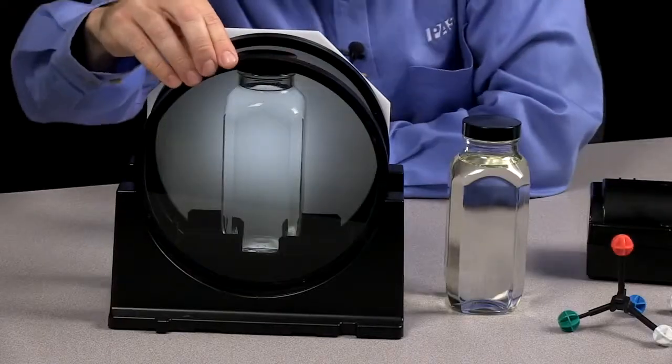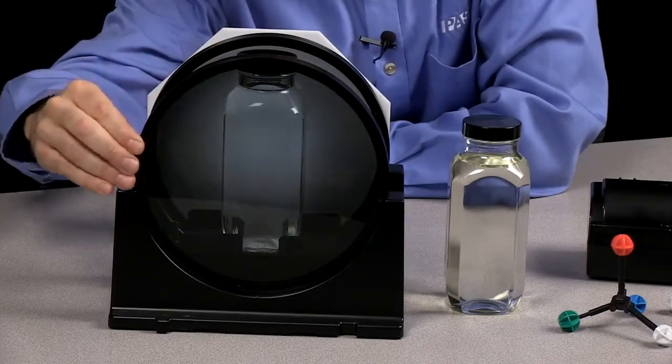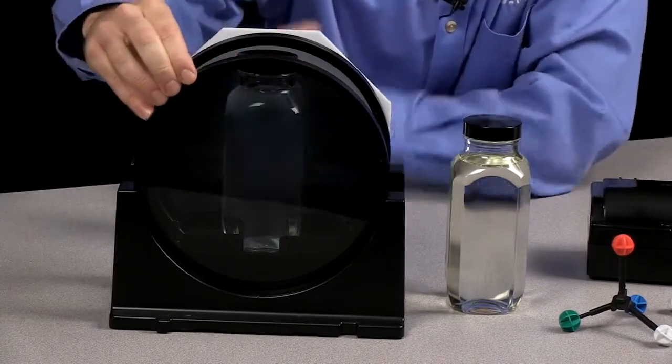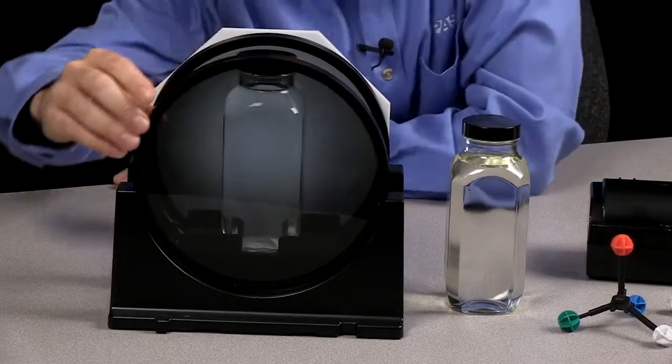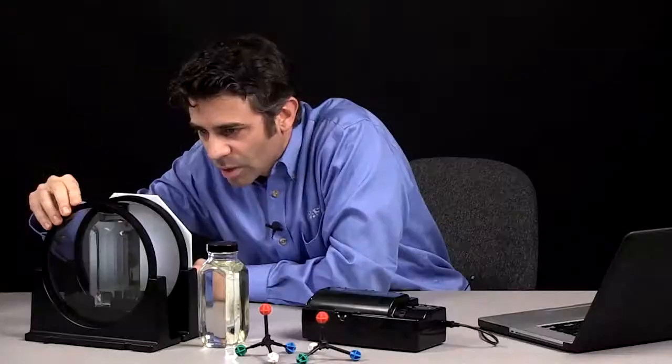And you notice when I turn the first polarizing film, that the sample and the film around it get darker. The water is not having any effect on the brightness of the light.